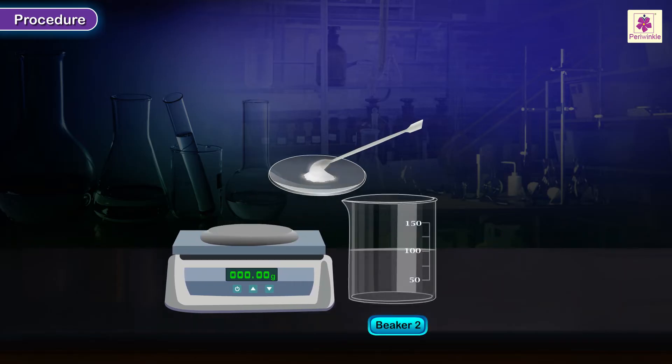Dissolve the sodium sulphate in 100 ml distilled water in the other beaker.